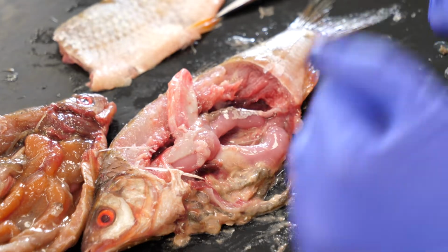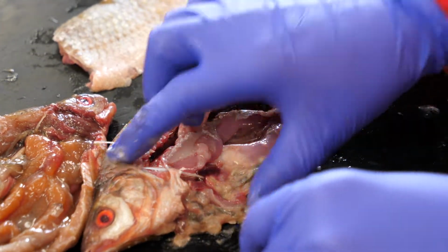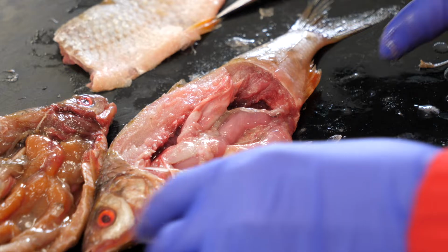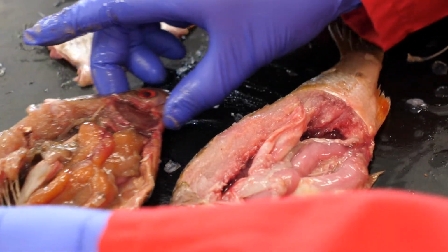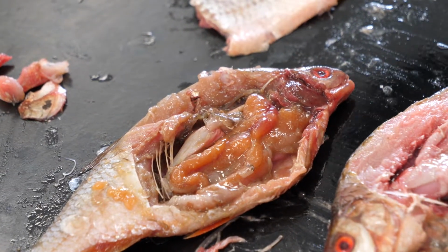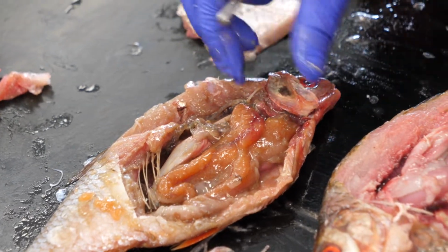So what I'm going to do is supplement this with another video, so you can see more detail going into the digestive organs, and talk about the swim bladder. But the structure that I want you to look at today is in this fish here. I've already dissected this one. What I want you to look at on this fish is the operculum I have removed. So that's that there.